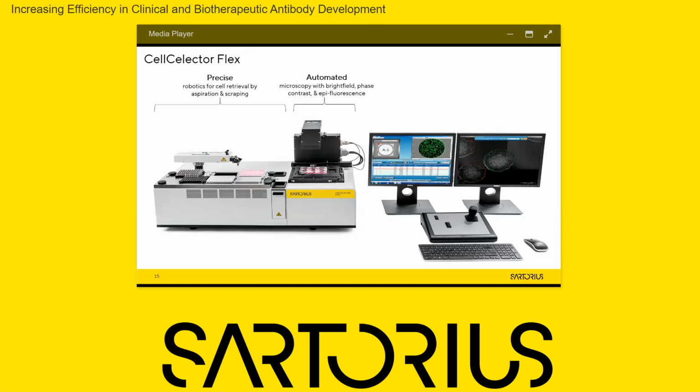And then over on the right-hand side, this is how the whole system is powered. We've got the software and the joystick controller that allows us to analyze the images that the CellCelector produces, make our cell selections, document the selections that we've decided on, and also document before and after images so that you can see the results of your picking. And also this is where we control the robot's arm and all of the processes with the system.